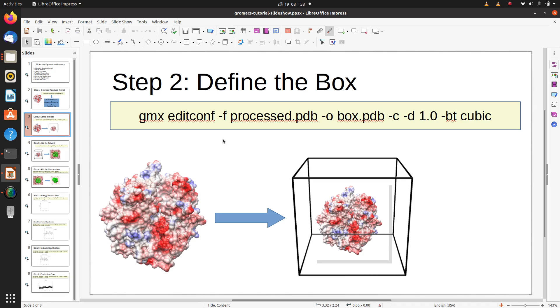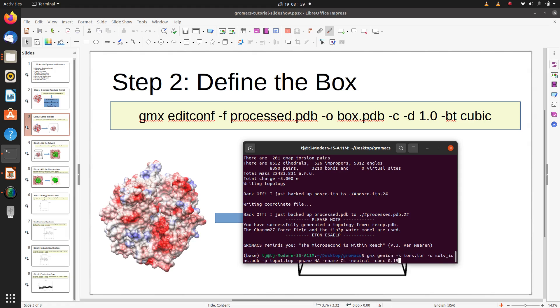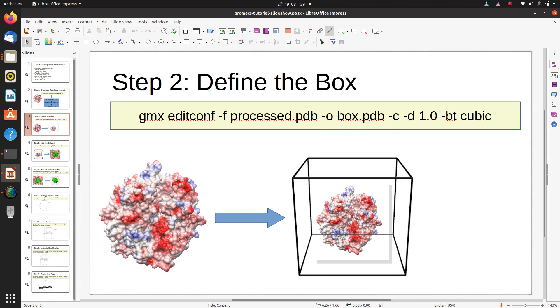The second step is to define the box around which we want to fill the solvent around the protein. Using the editconf command we can specify the box type and the distance radius around the protein. This can be 12, 14, or 8 Angstroms, but it's better to use around 10 Angstroms. Running this command generates the output file box.pdb with an imaginary box around the protein.